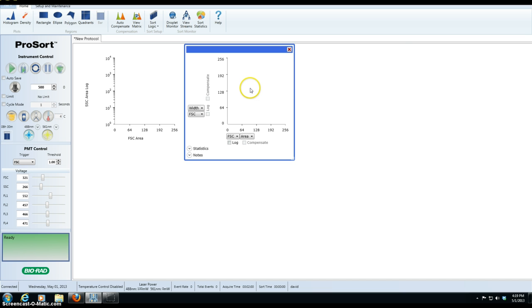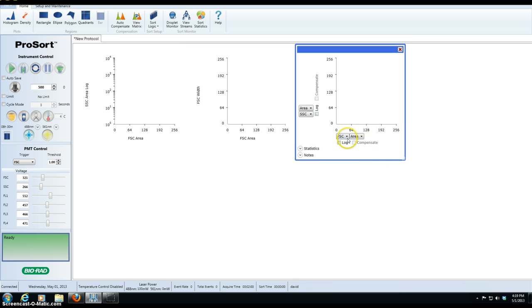And finally, we're going to run GFP expressed in cells. So I'm going to make one last graph. We're going to look at GFP. So I need to use the FL1 graph. I'll use it on log scale. And I'm going to look at it against my log parameter here.